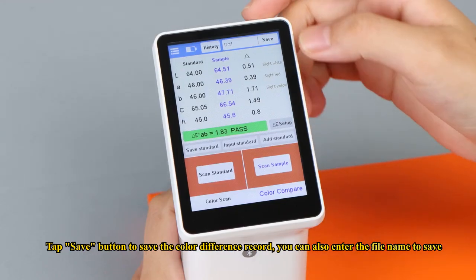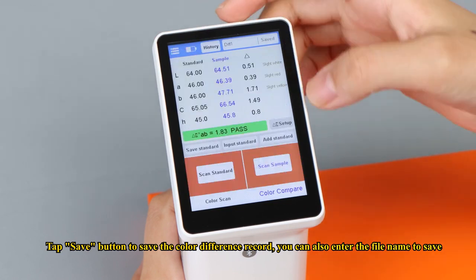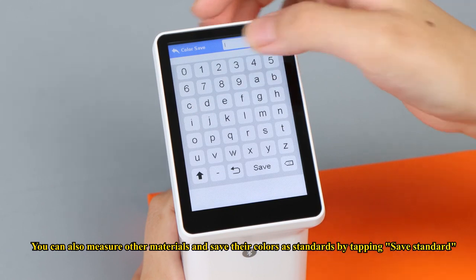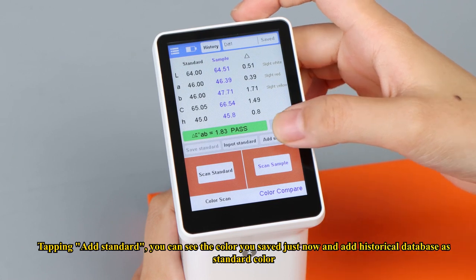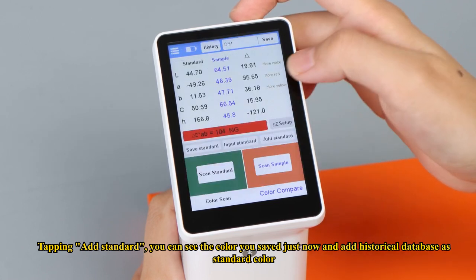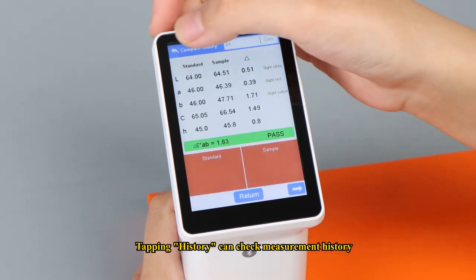Tap the save button to save the color difference record. You can also enter a file name to save. You can also measure other materials and save their colors as standards by tapping save standard. Tapping add standard lets you see the colors you saved and add them from the historical database as standard colors. Tapping history lets you check measurement history.